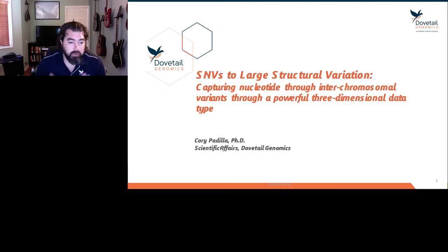And so what I'm going to talk to you about today is being able to capture SNVs and large structural variants in terms of inter-chromosomal translocation events using a 3D NGS approach to genomics.